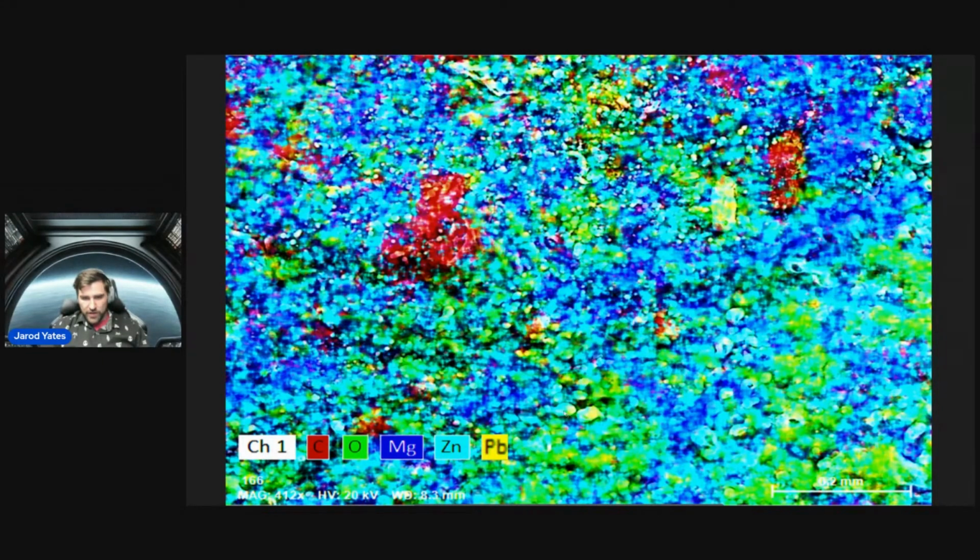So you see a very thin layer of this turquoise zinc here on these guys, very thin layers of turquoise zinc. And then you see the yellow lead coming out and peeking out of the ends there. And for this particular spot where it ruptured, you can see we got like this Mount Vesuvius kind of thing going on of the lead peeking out all over the place.